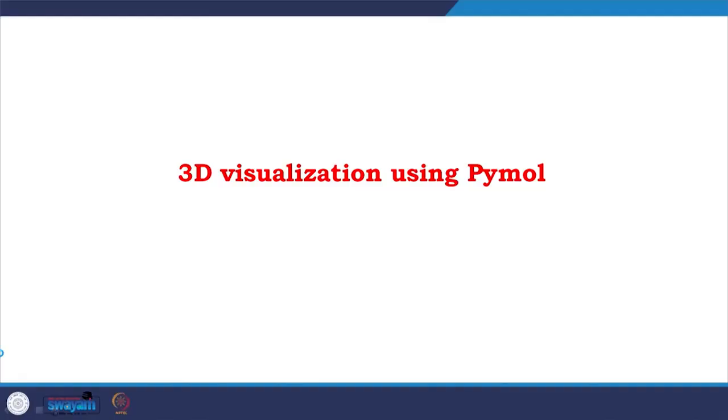Today we will be starting with the softwares which are majorly focused on visualization. COOT is also a visualization software, but people do more functional work like modification and all. So, let us come to 3D visualization with the visualization platforms, and I would majorly focus on a software platform which is called PyMOL.